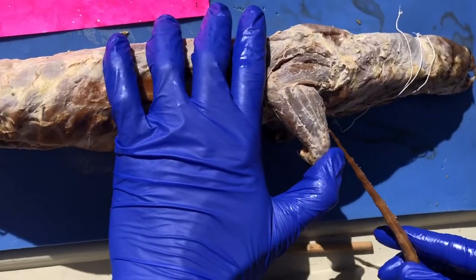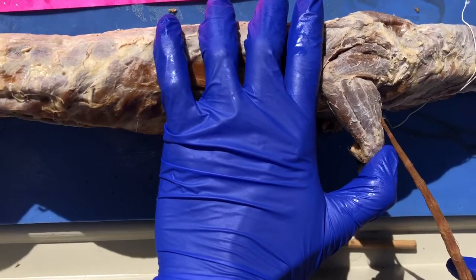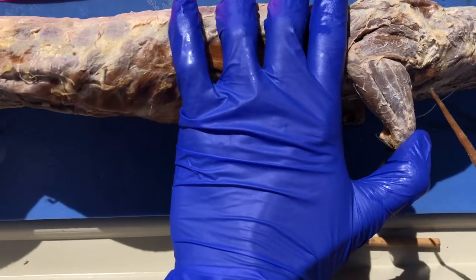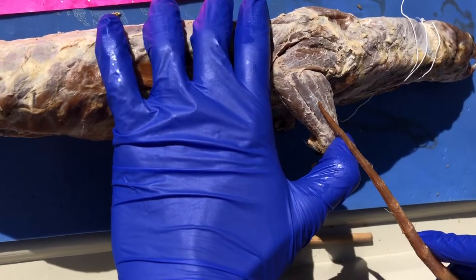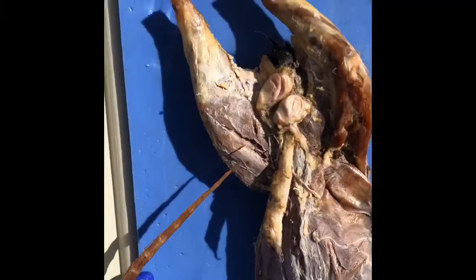Right here on this side we have the brachioradialis. Here we have the extensor carpi radialis longus, and then this is the communis, and then we have the lateralis right here. And then here we have the extensor carpi ulnaris, and then here the flexor carpi ulnaris is right here on this side.